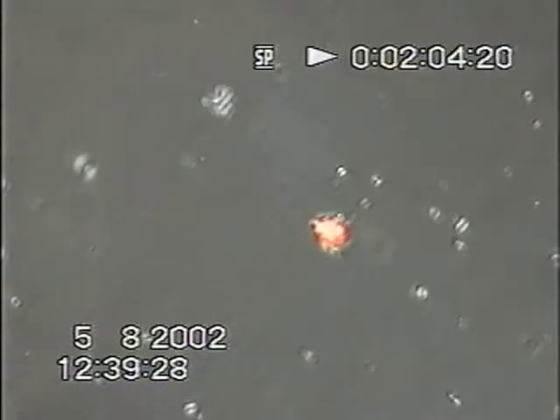And one which is even more active, microscopic techniques. This is on the 20 lens to show a piece of red pollution and the large numbers of motile organisms present.